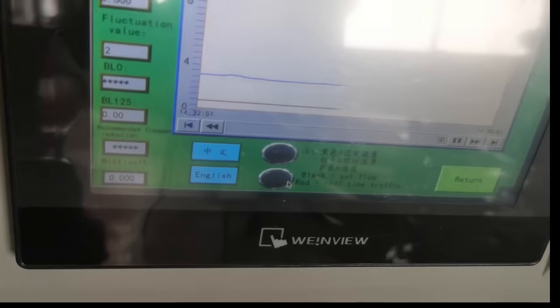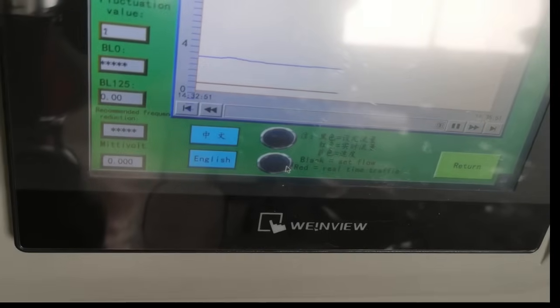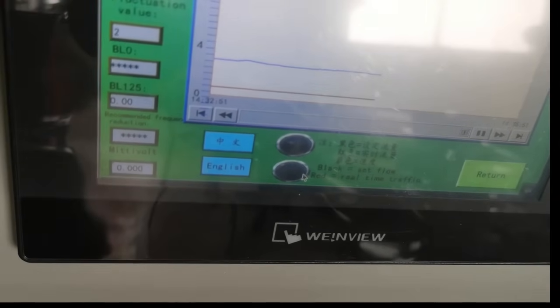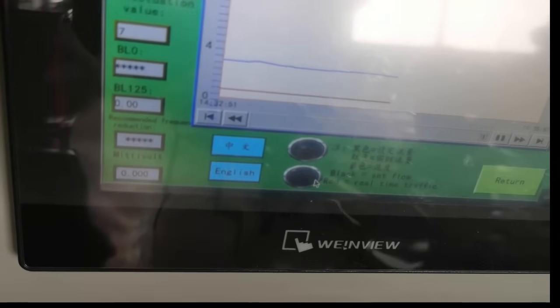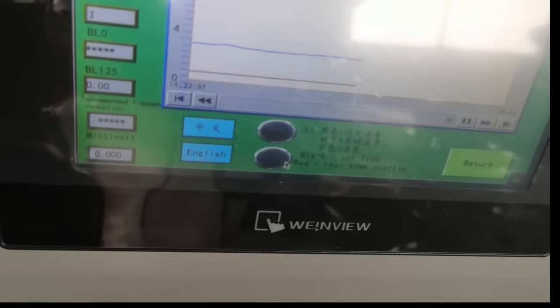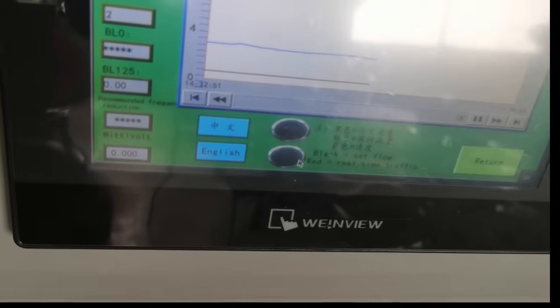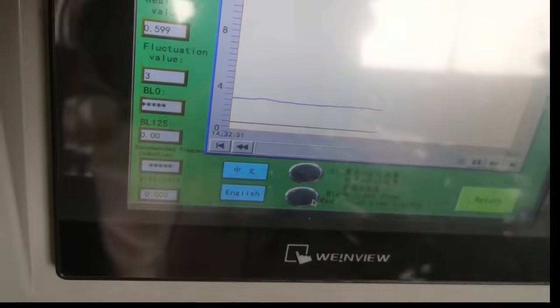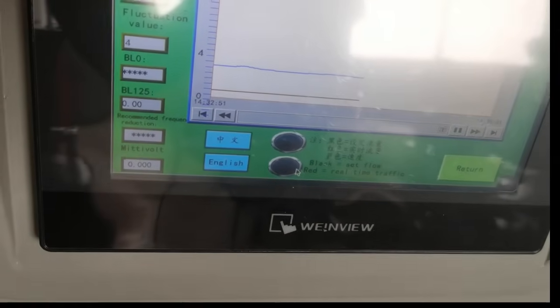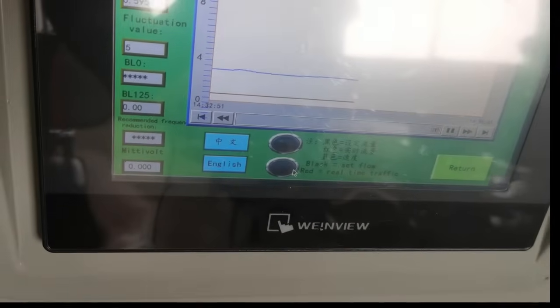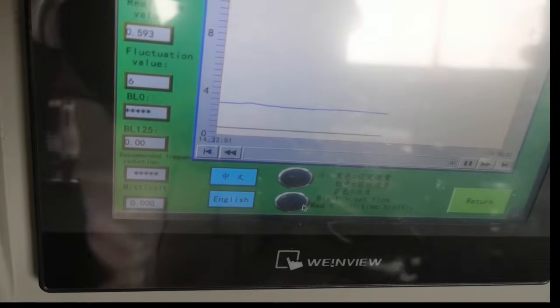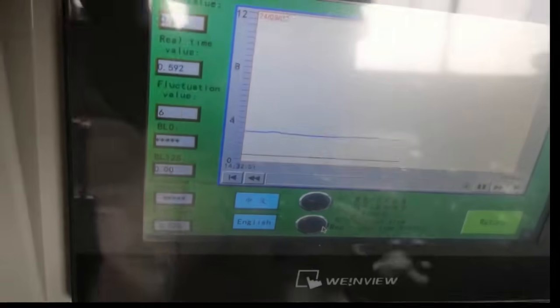Now red and black stay together, means that the real flow rate is very similar, nearly the same as the black set flow.